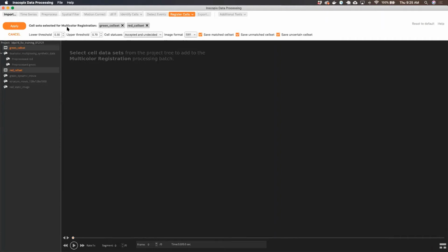Okay, thanks. Shay, just one quick question. There's no limit imposed on the e-focus value of the different channels, correct? Or is there? There's not that I'm aware of. That's an IDPS question to be sure, but I'm pretty sure that you're allowed to either do it at the same focus value if you want, or anything different. So you could image both the red and green at the exact same e-focus value. Of course, because of chromatic aberrations, that won't be imaging the exact same plane.